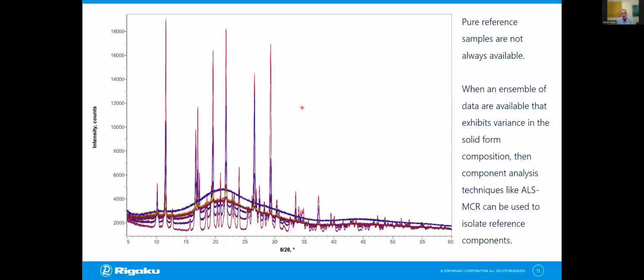as shown below, we can do the component analysis on the measured data of the unknown materials themselves. So if you're looking at a drug product, looking at a tablet, you collect measured data on multiple batches of tablets, maybe slightly varying conditions, to generate some data that has some variability within it.